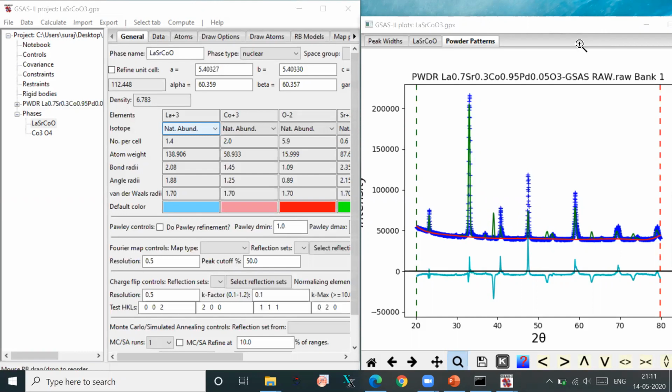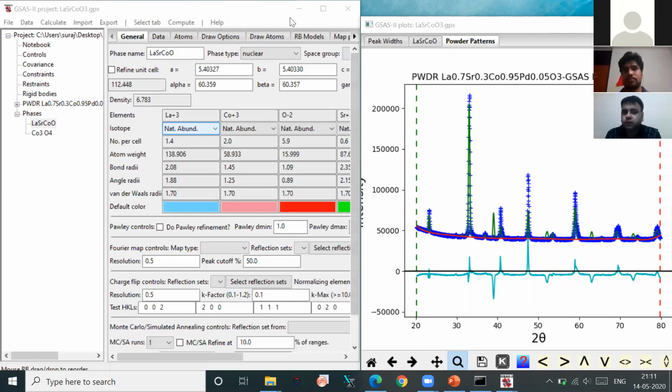But all of you must practice it, and I want to see that you have done that. You have tried the fitting, you have understood the fitting, because just listening to this and keeping quiet will not help you, since all of you need to do this at one point or the other. And always remember that we don't have very sophisticated instrumentation, for example XAFS, which Vishwadeepa was showing, and others where we can get the lattice, the positions, or the oxidation states. So we rely on the XRD.